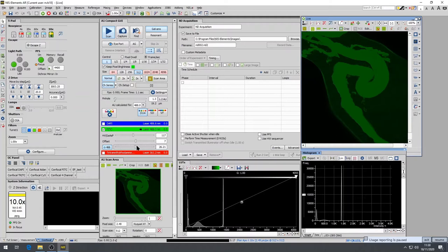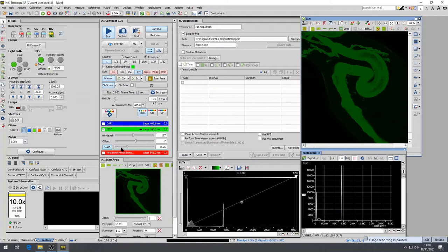Above 120, you run the risk of amplifying noise and artifacts. In general, it is best to work with higher gain and lower laser power than the inverse.